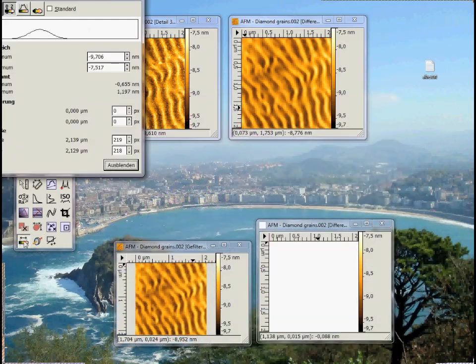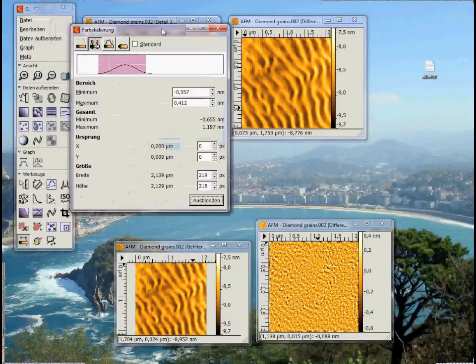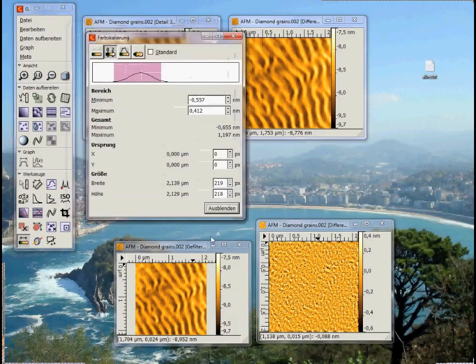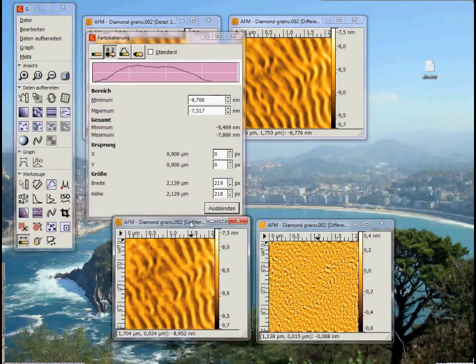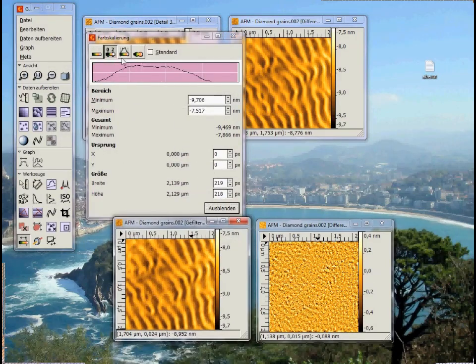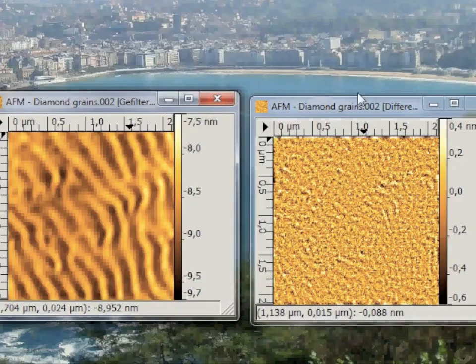Then you get two images: the back transformation of the selected areas and the back transformation of the unselected areas. Now I adjusted the color scale to see the signal. On the left you see the long wavelengths of the image.